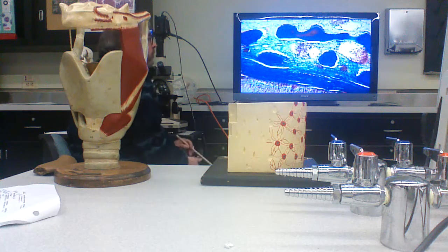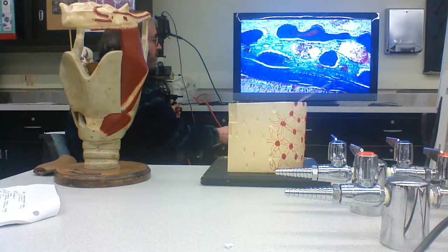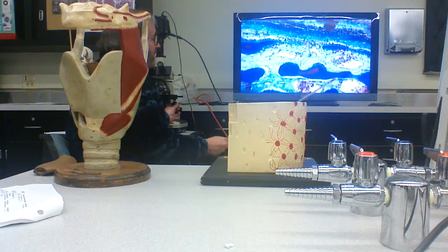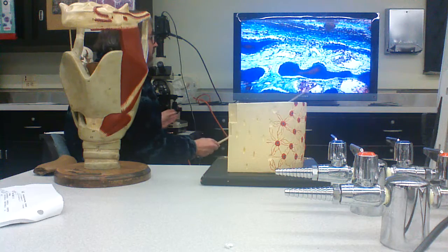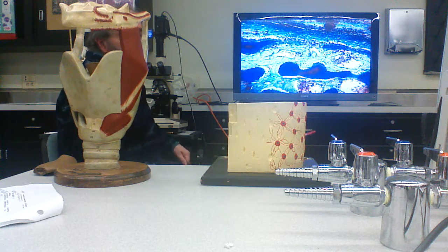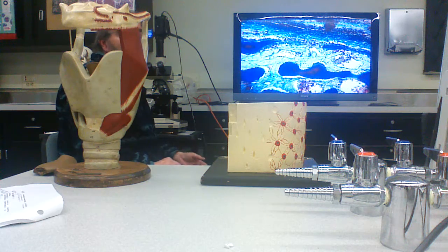And here there are two connective tissue membranes between the brain and the skin. Here's one of them, right? And here's the other. And this, right, is bone formation between those two connective tissue membranes. So this is called intramembranous ossification.